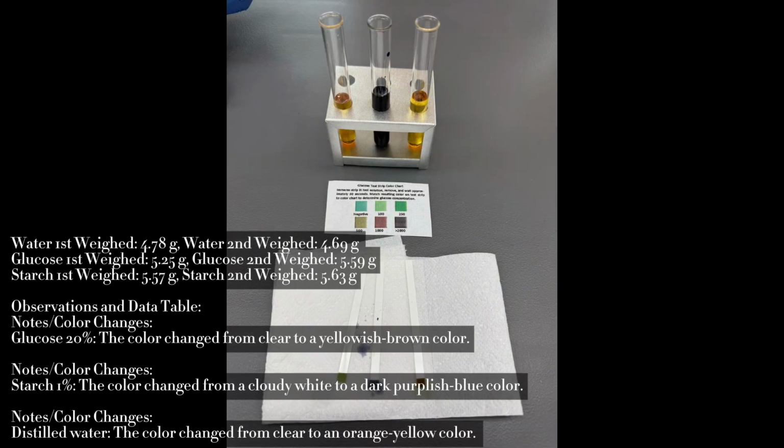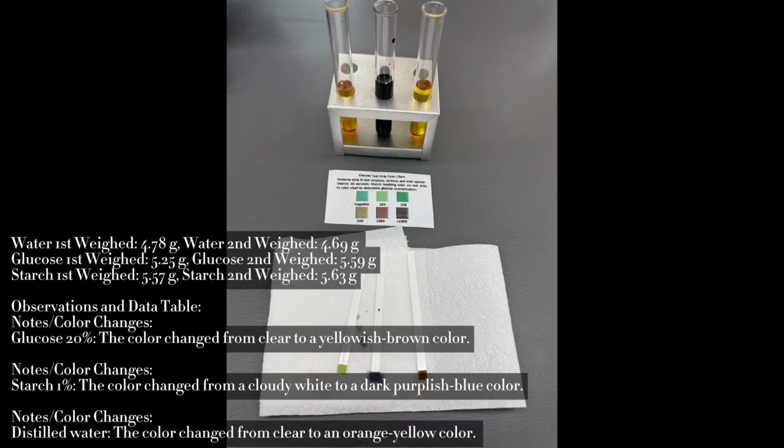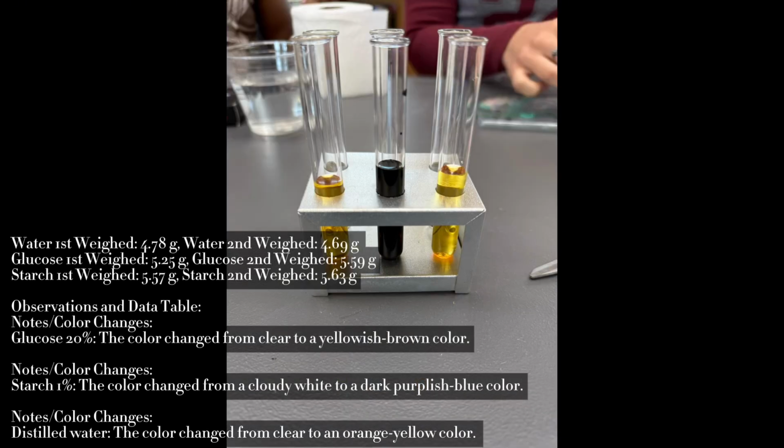Step 9, cleanup. Finally, we put away the dialysis tubing, wash the glassware, and clean up our workplace.